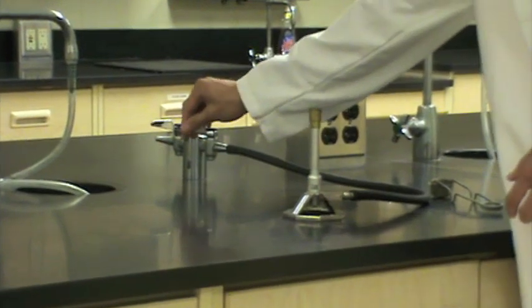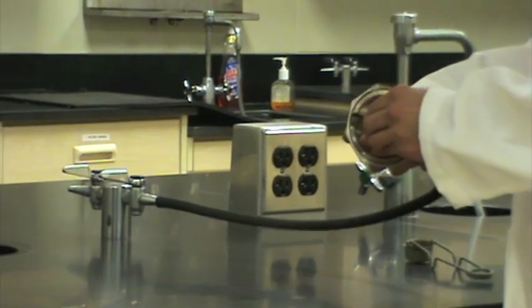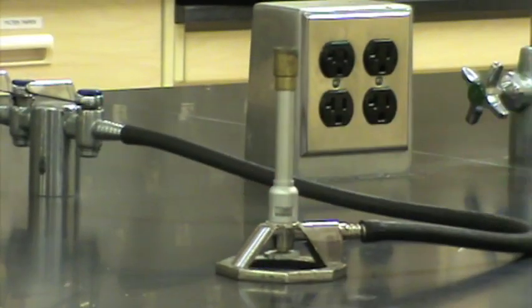Make sure the gas is turned off at your station, both at the valve and on the burner itself. You can check this by turning the valve on the bottom all the way to the right. Once everything is set up properly, turn the valve about a half turn to the left to allow gas to flow through the burner.